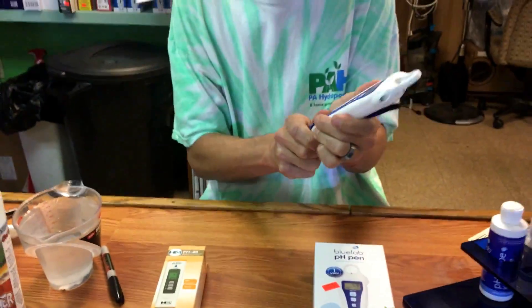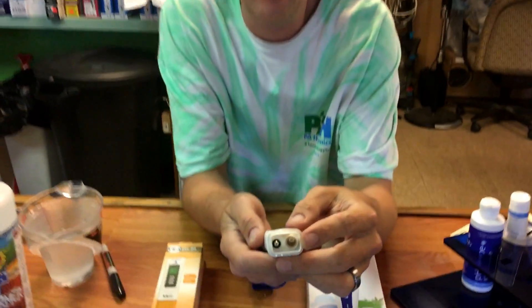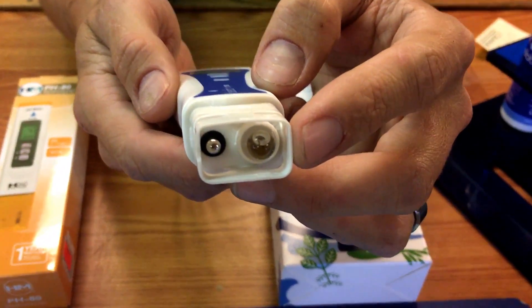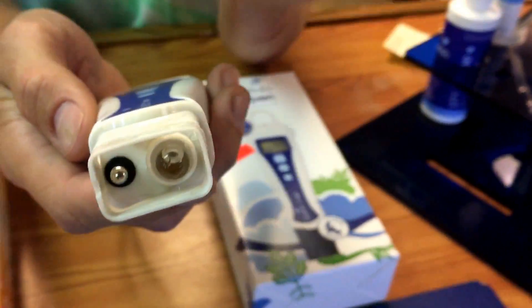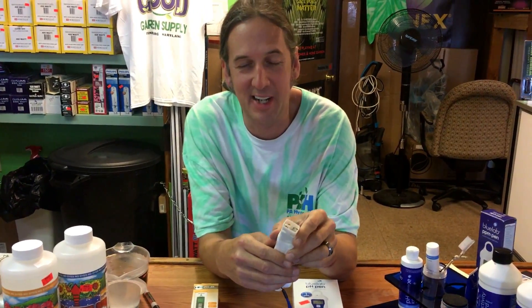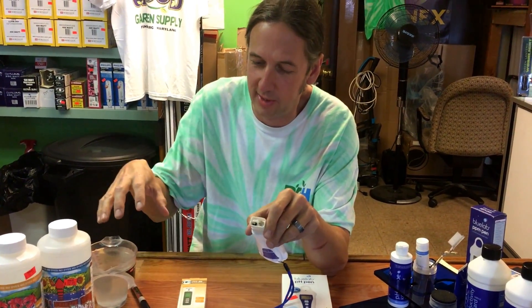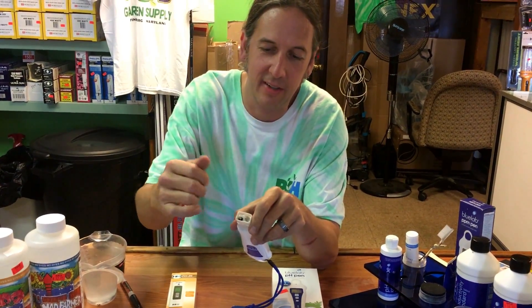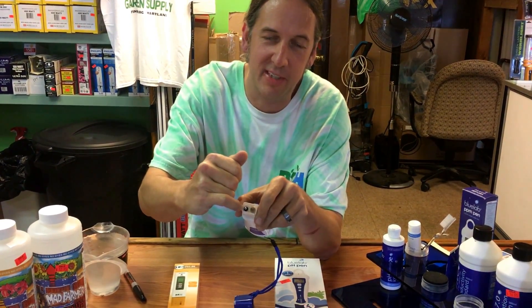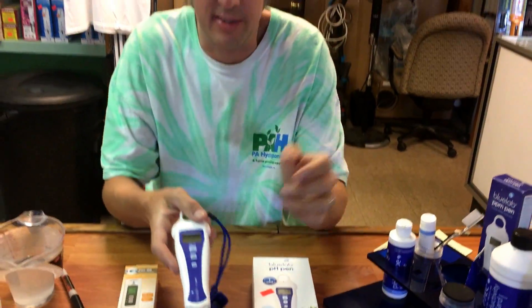All meters have a little glass ball at the bottom. Customers sometimes come in saying their meter has leaked and there's liquid inside — but it's supposed to have liquid in there. That's potassium chloride, and it's full of ions. Ions come out through that glass, go into your liquid, and then come back. The meter compares it to a side piece called the junction, and then the internal computer figures out the pH value.